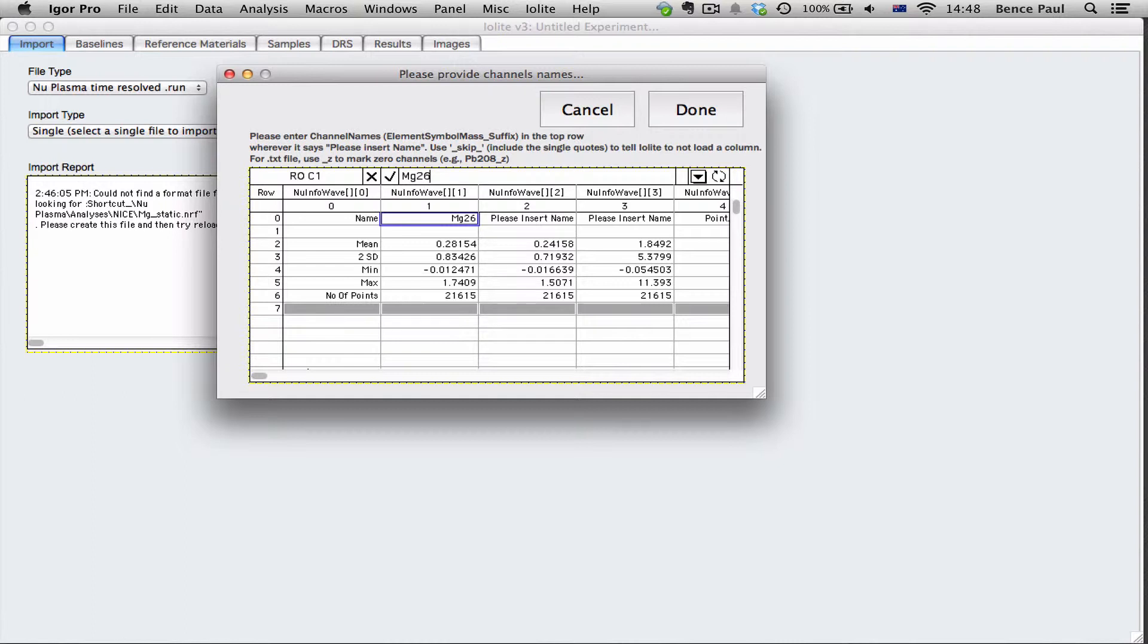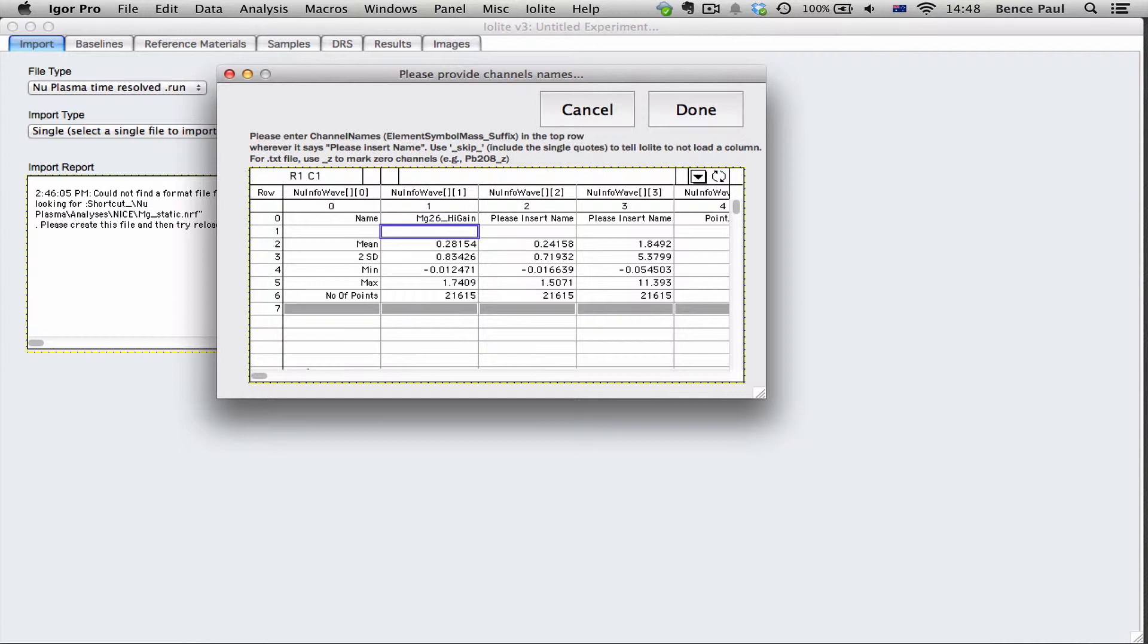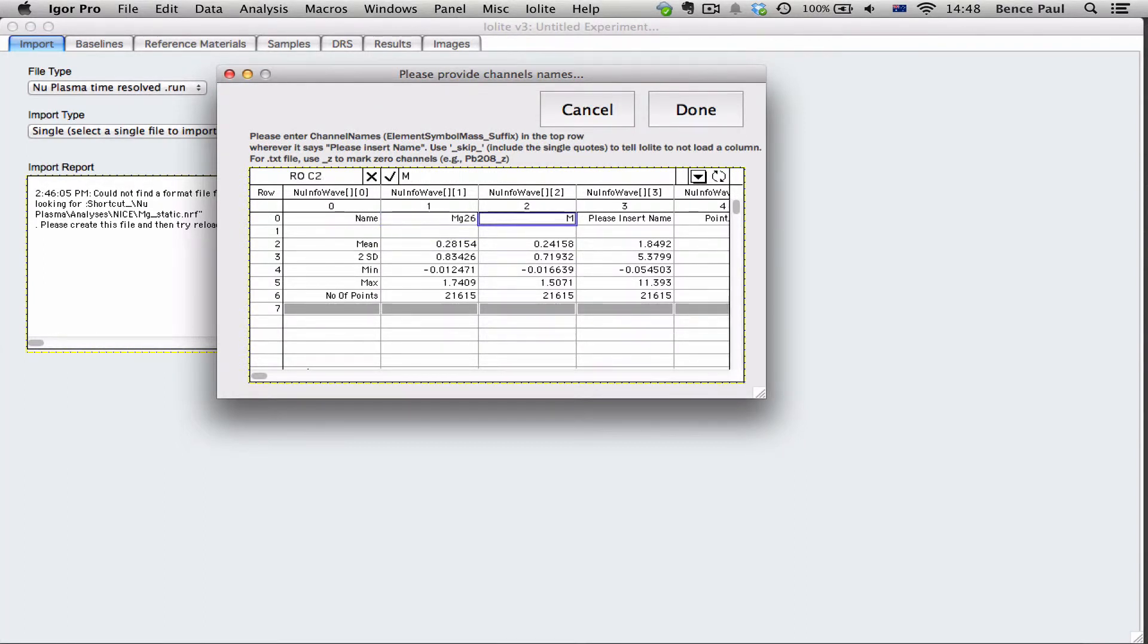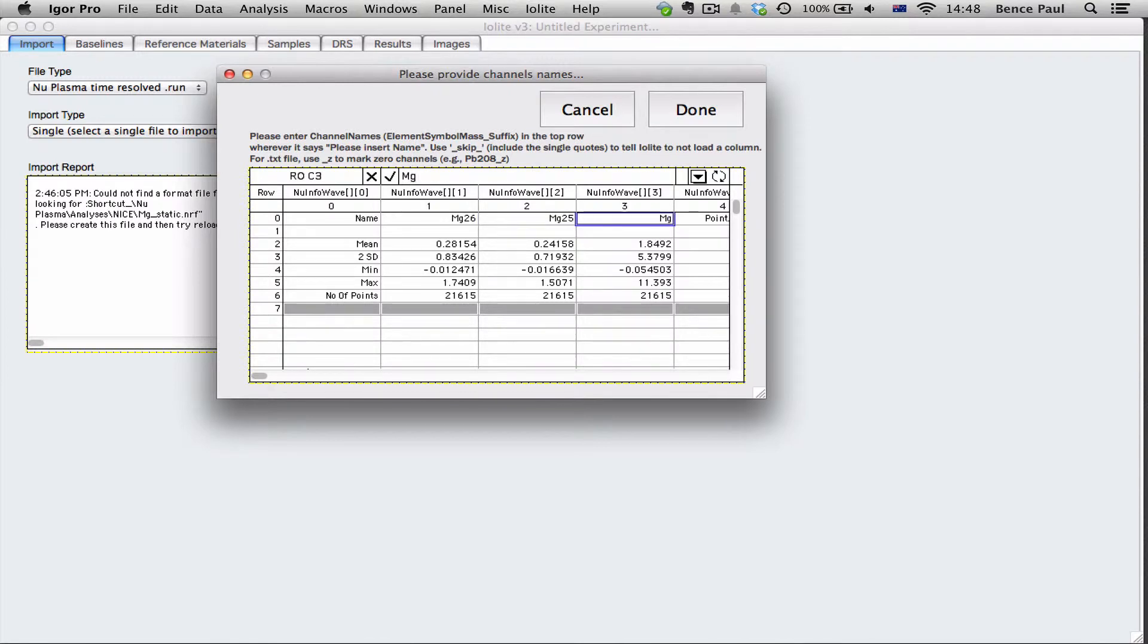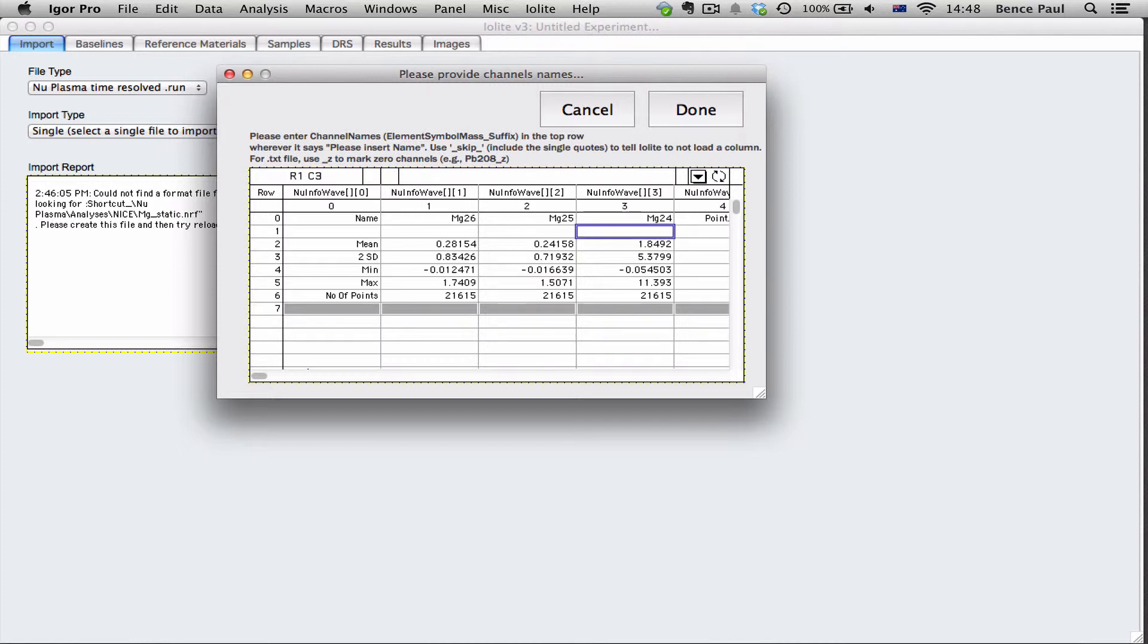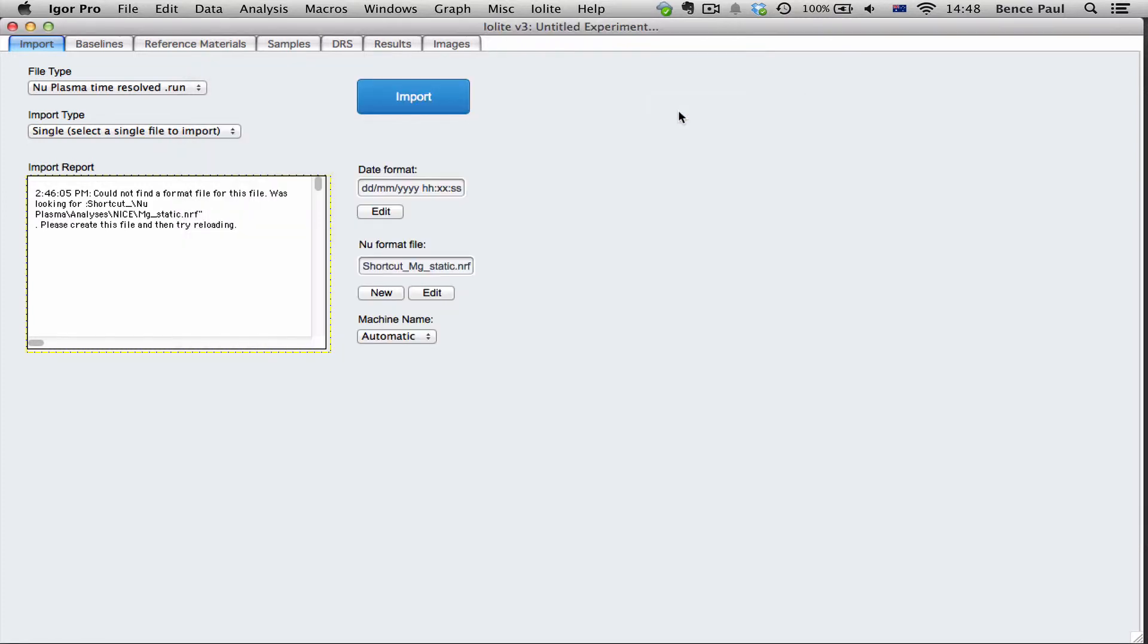So we need to name it and we do that by putting the element first and then the mass. You can include a suffix if you could think of one. Let's say high gain. Just for this example we'll just use magnesium 26, magnesium 25 and magnesium 24. And now when we click done it will create that new format file for us.